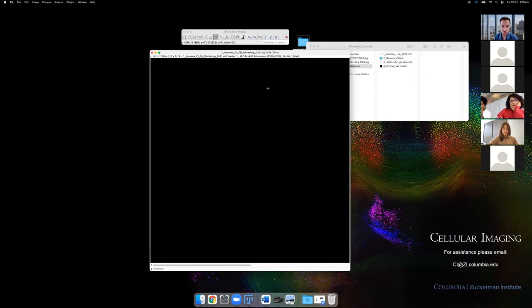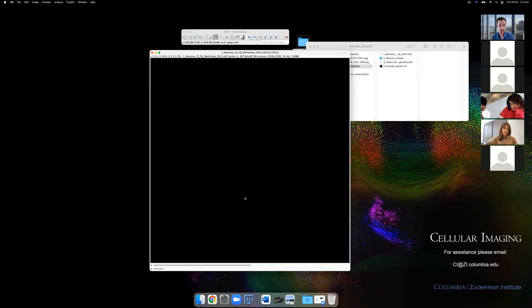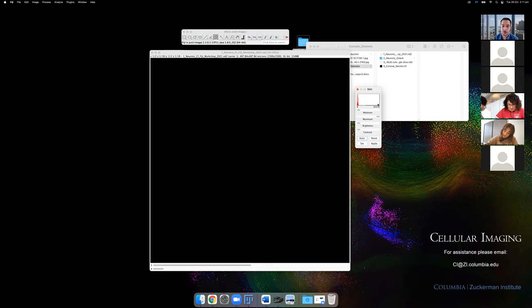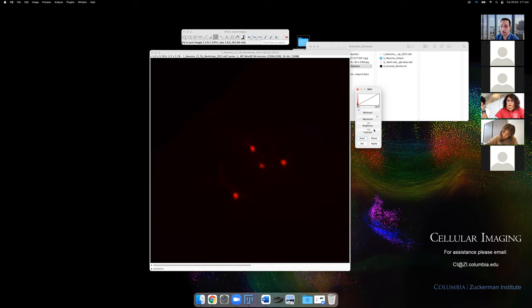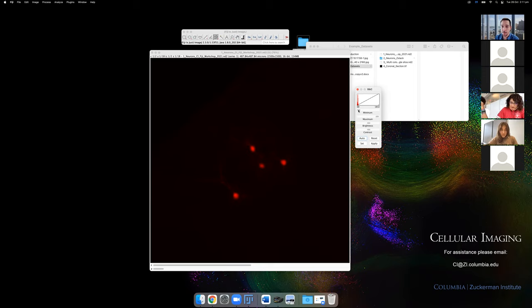If you're working on the spinning disk, you often get images that look black but have a lot of information. The first thing you'll want to do is adjust the brightness and contrast — on PC that's Ctrl+Shift+C, on Mac it's Cmd+Shift+C. This brings up the display adjustment with a histogram showing intensity information. The big peak is usually background pixels from the tissue or the slide background.